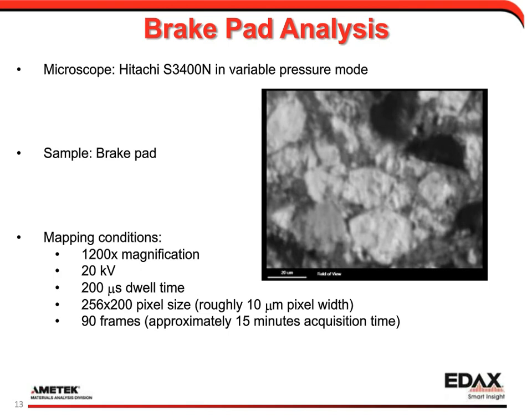And another reason for using the Hitachi microscope is that this is a full brake pad. It's not a cutout, it's not a segment of it. We actually fit a full brake pad in there. And it's used at that, so there's a bunch of contamination and other stuff on there. So this is close to a real-world sample.